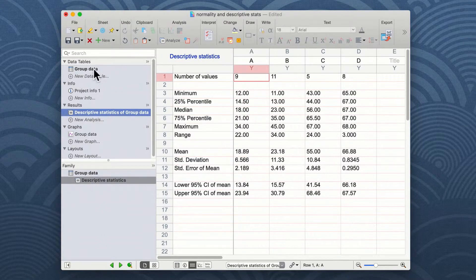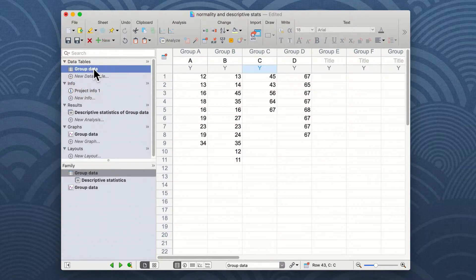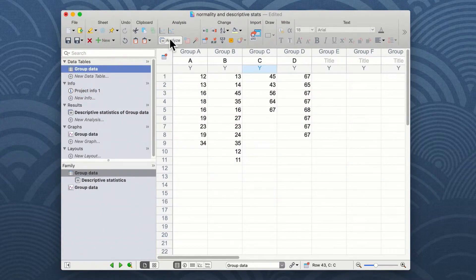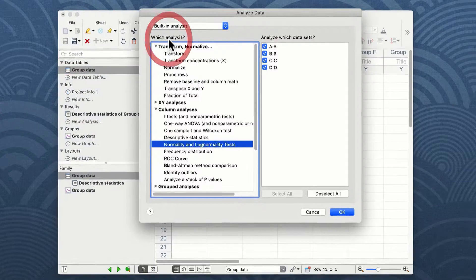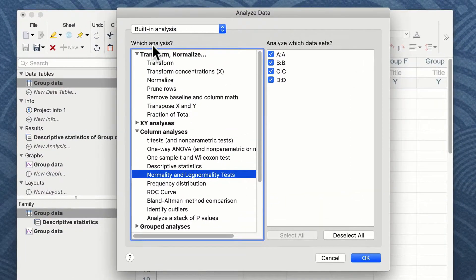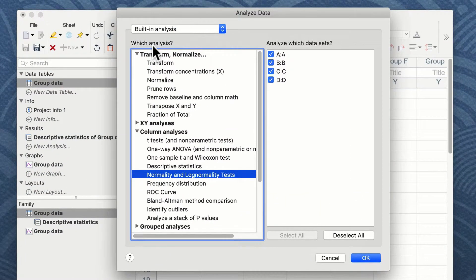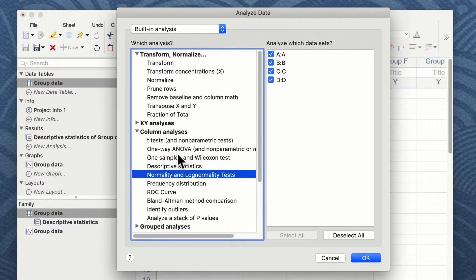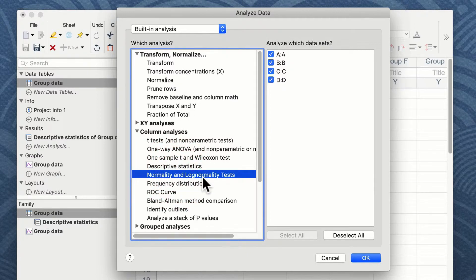We're going to return to our group data table, and we're then going to click again on the analyze button. Once more, the analyze data window appears, and from the left-hand side we choose normality and lognormality tests.